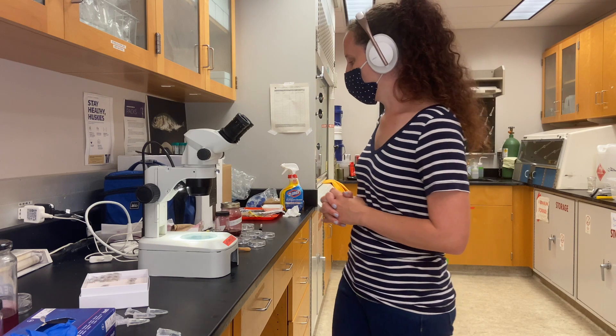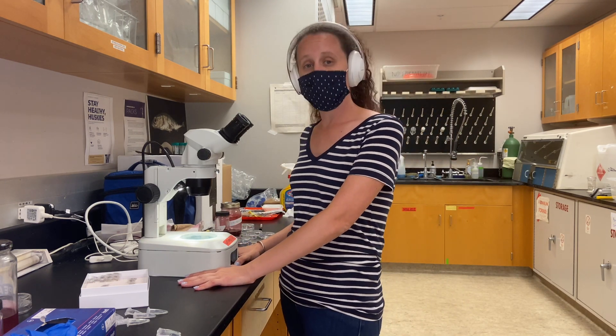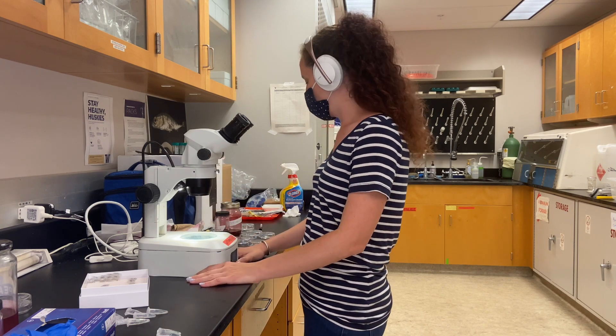So today, first, we're going to start with the staining, and then these will sit overnight, and then we'll come back tomorrow and start the de-staining process.